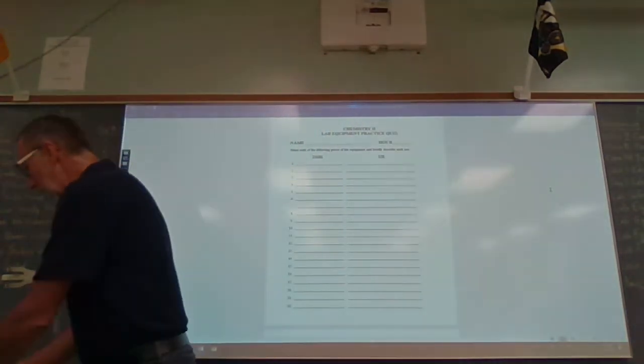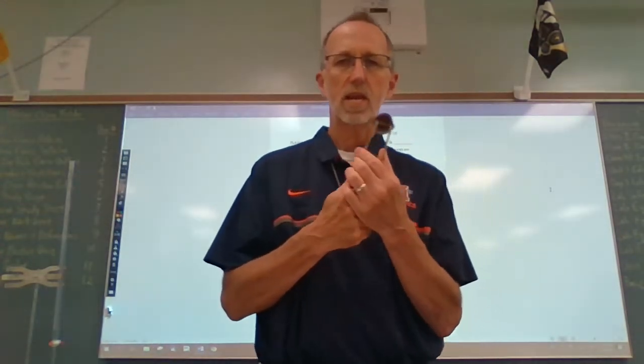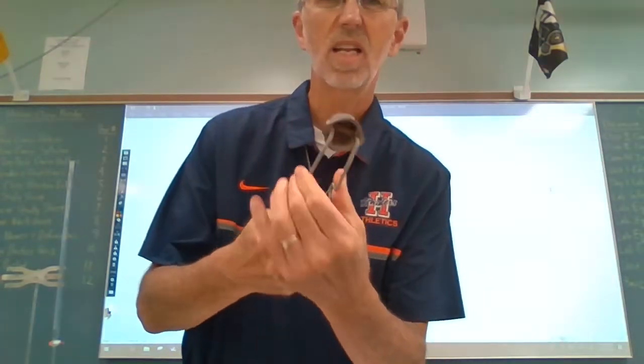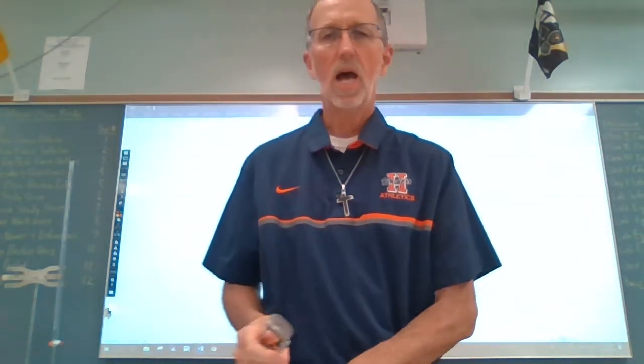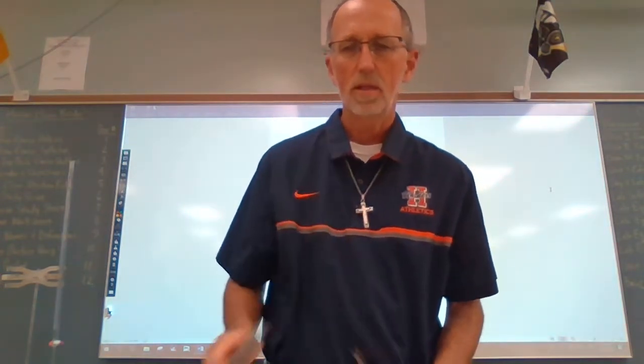16 is a striker. All right. So this is a standard striker here. Can you see that? Is it even sparking? Not very well. I need to replace the flint on there. I don't like these things. They're really kind of unreliable.